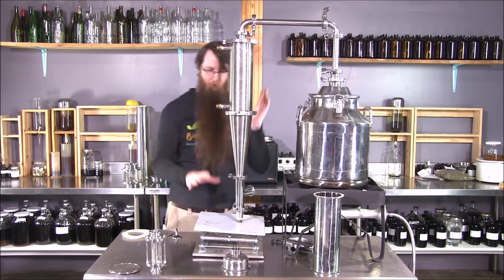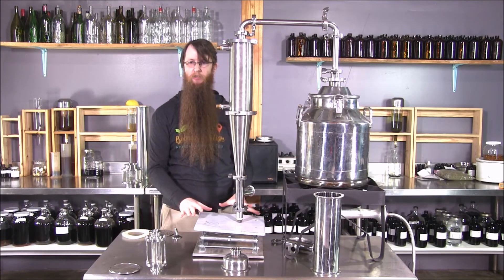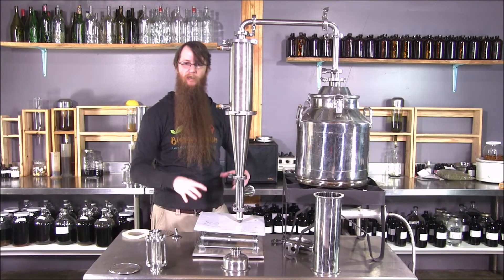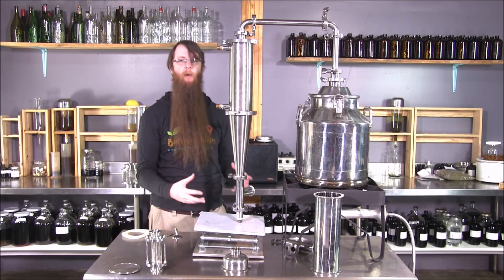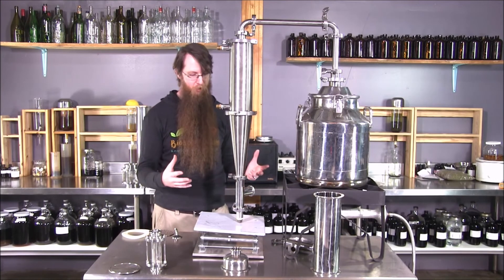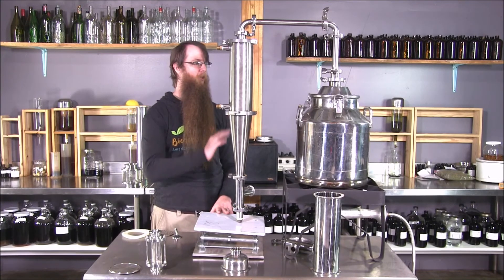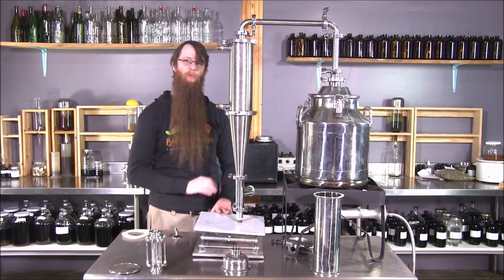Lab stands, around 30 to 40 dollars, adjustable height — they're a really easy way to get things where you need them to be, and especially handy when doing glass labware work or tri-clamp work. I hope this short video has been helpful. This is a wonderful piece of equipment if you do a lot of medicine making, especially with laboratory glassware or stainless tri-clamp ware. I encourage you to pick one of these up.